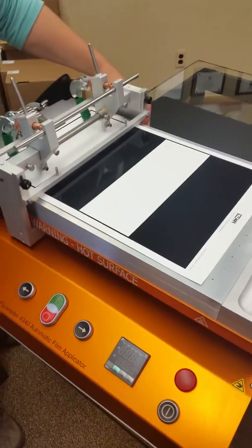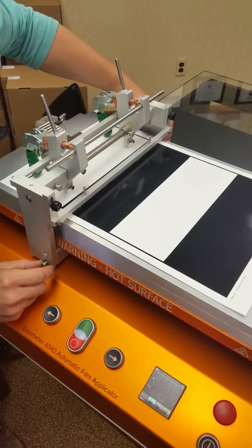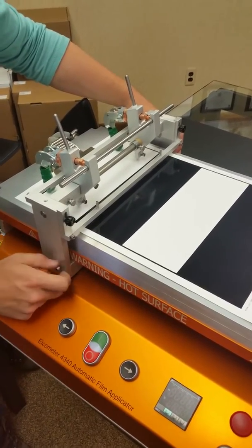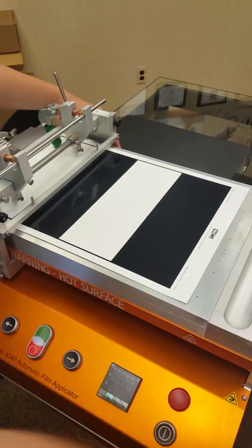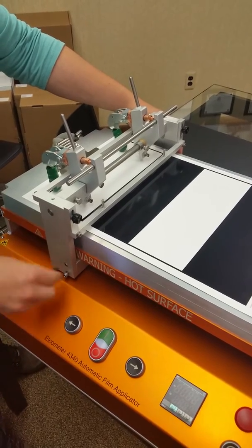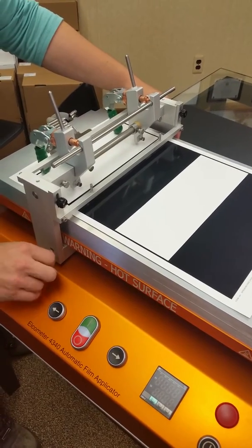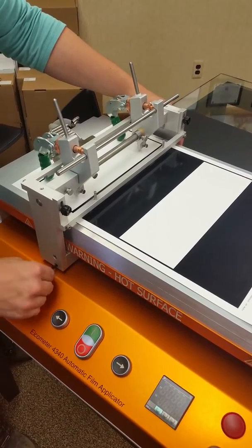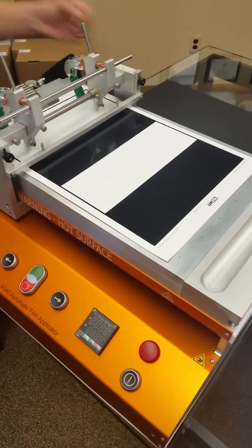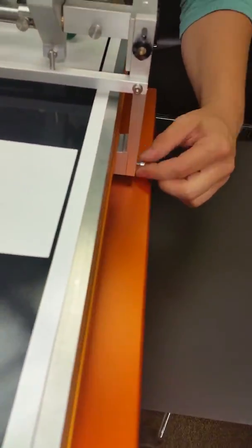This attachment allows you to use the spiral bars or film bars such as a Baker Doctor Blade using a push bar.